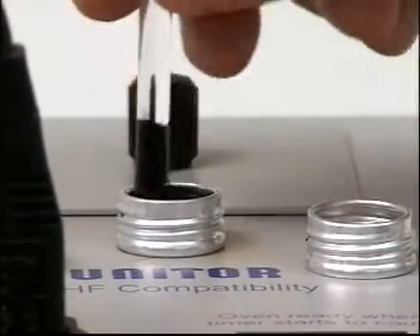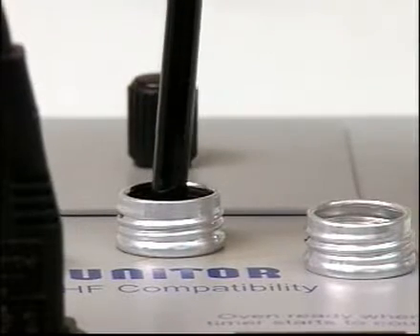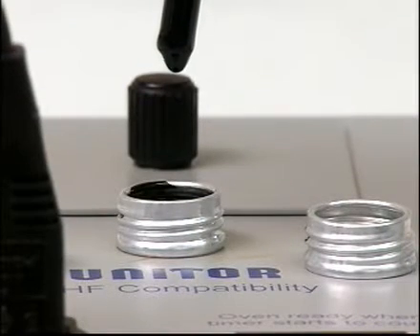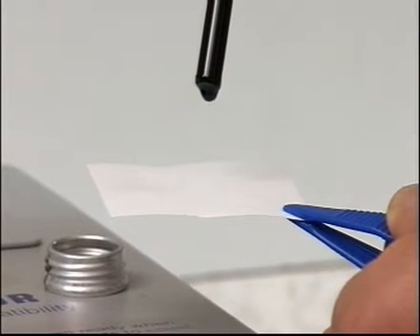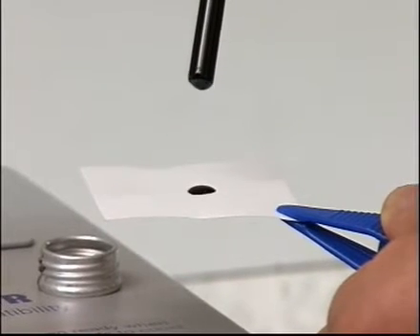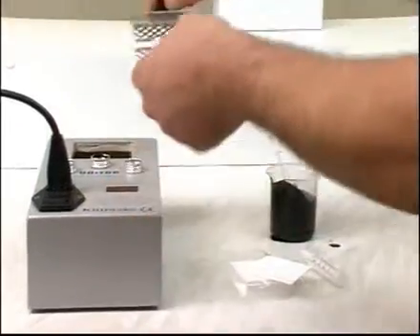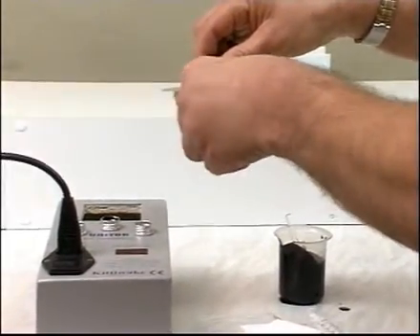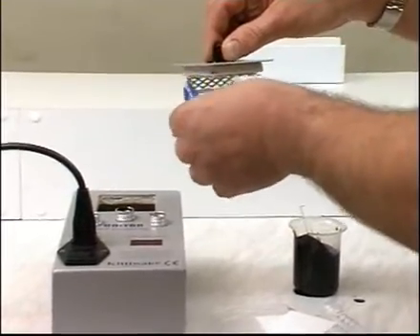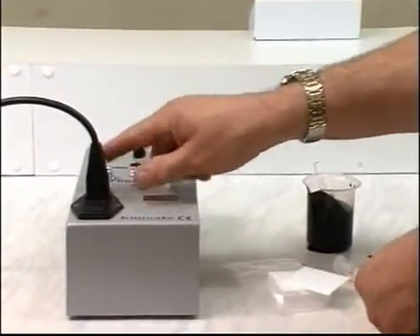Stir the oil with the rod provided for five seconds, then remove it without touching the sides of the sample tube. Let the first drop fall back into the tube and direct the second drop so that it falls onto the center of the test paper.